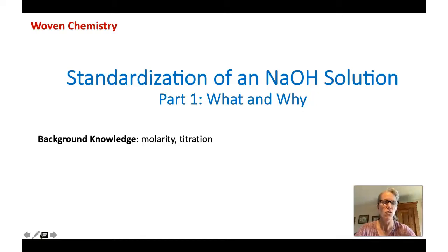This is the first of a three-part series of videos in which we're going to focus on standardizing a sodium hydroxide solution. Part 1 is unlike most of my videos, where I'm just going to explain what titration is and why we would need to standardize a sodium hydroxide solution.